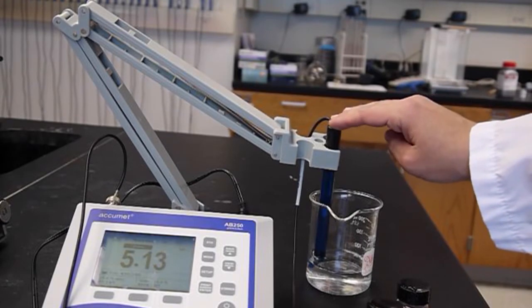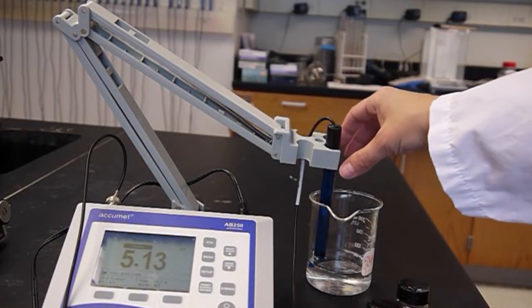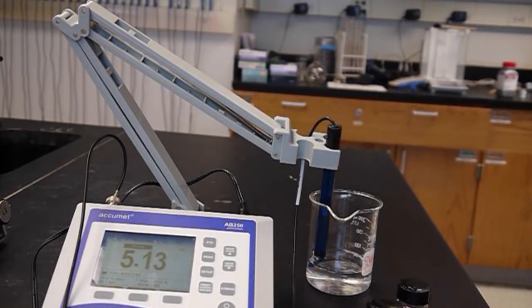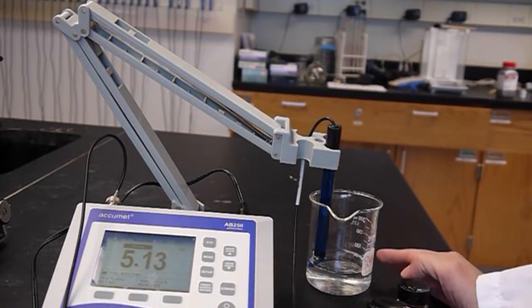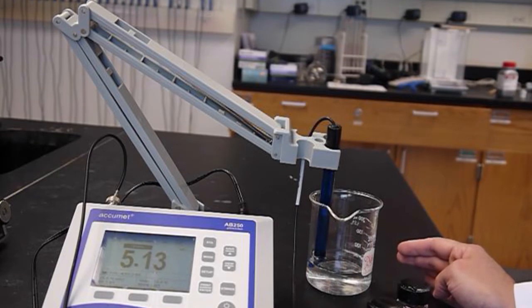So I've placed our pH electrode on the arm of the pH meter. This is going to hold the pH electrode for you while you're running your experiments. I have the electrode in a beaker of water. You want to make sure that the electrode is always submerged in water to prevent the glass bulb from drying out.